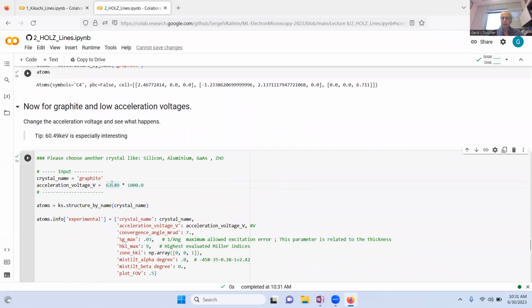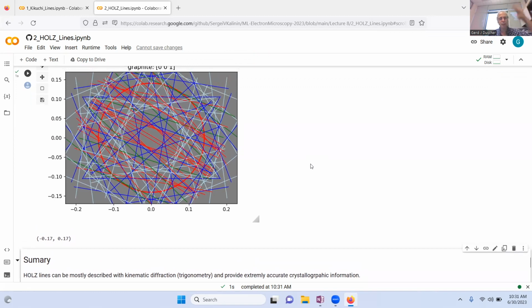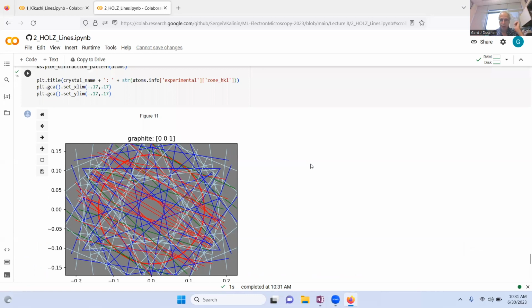And the reason they change that is usually downwards, right, is to have energy filtered imaging or diffraction, so that they have some amount of flexibility with the acceleration voltage and can increase that as they want to, and have different energies on the optic axis and within the alignment of the microscope.